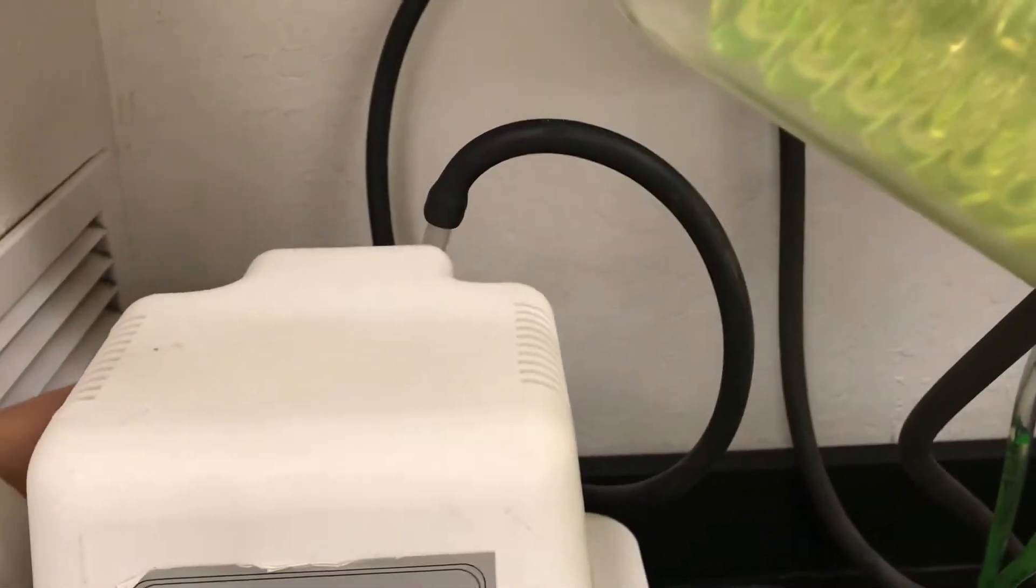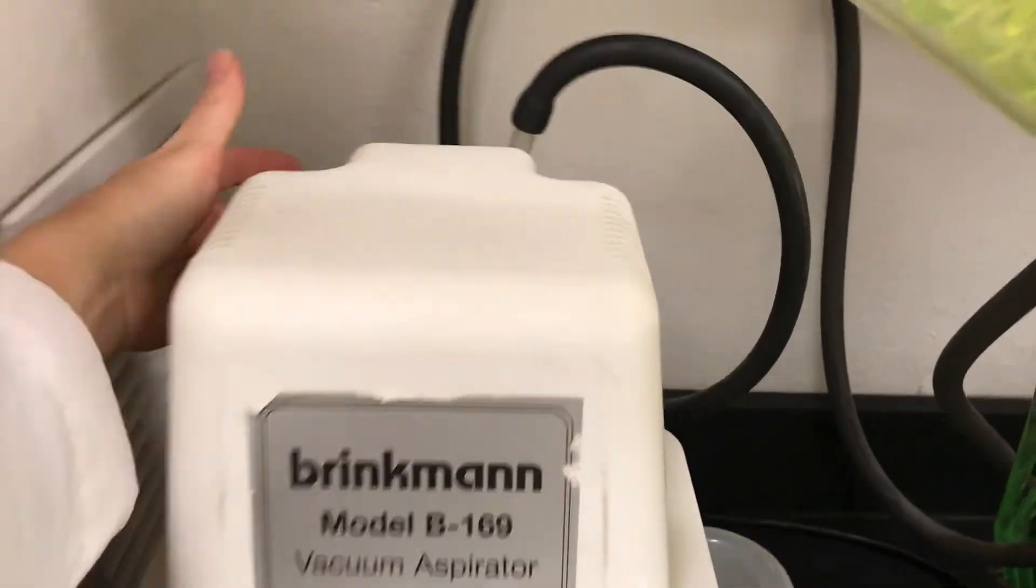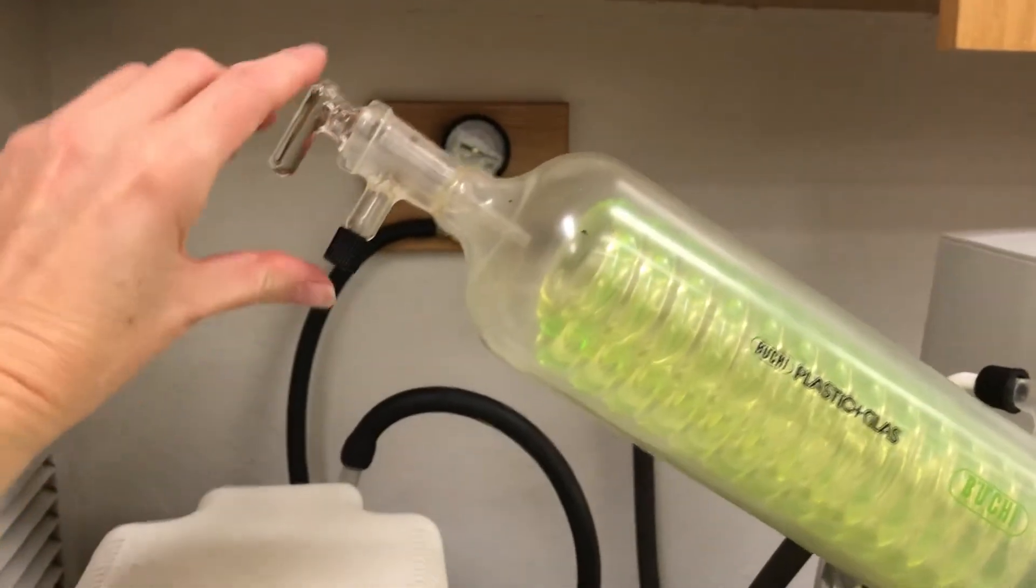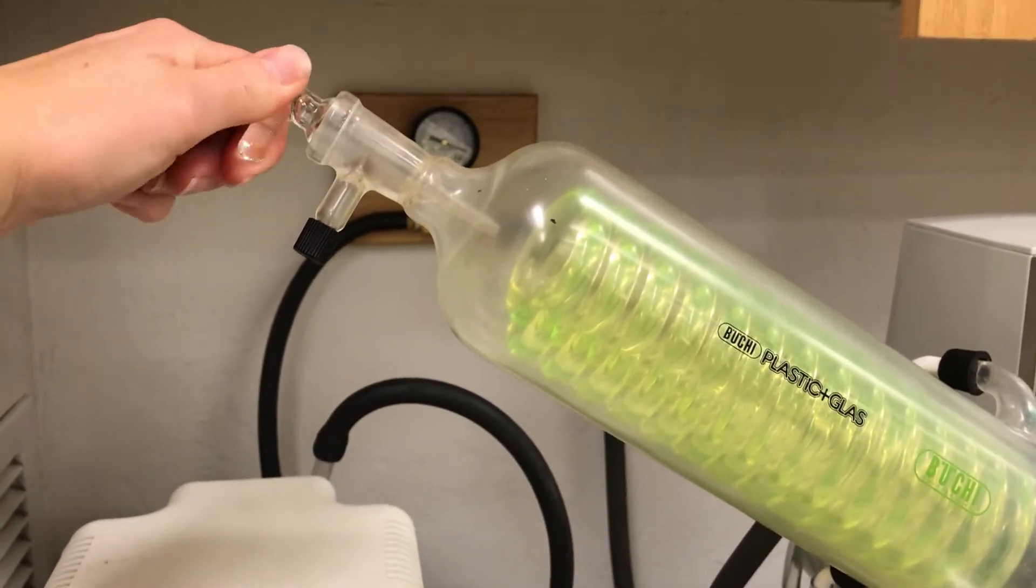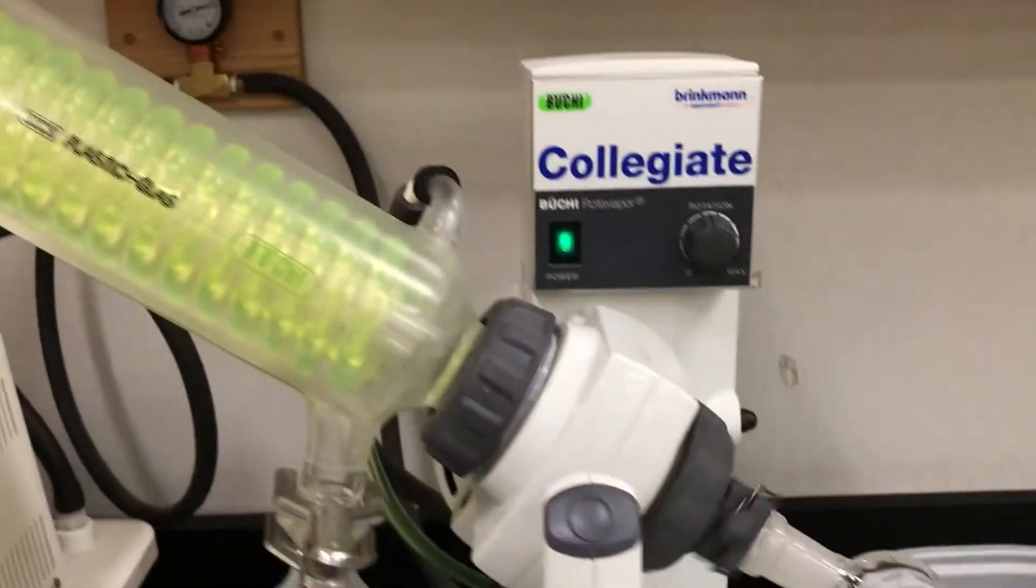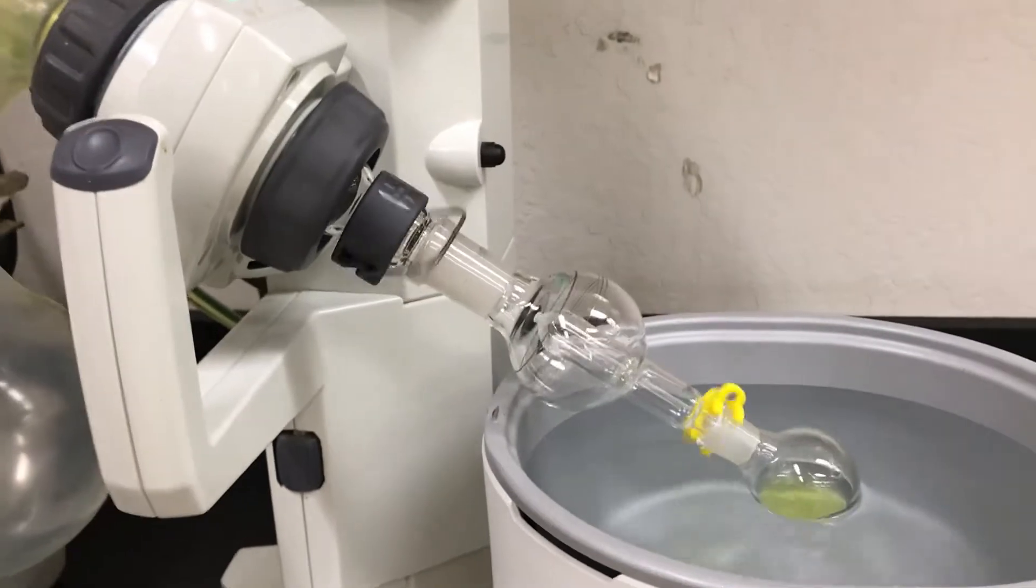Then you can turn on the vacuum and even when the vacuum is going normally you start with an open system. So this right here you can hear it's open. You're going to turn it 90 degrees to close the system and then the pressure is starting to lower inside of the instrument.